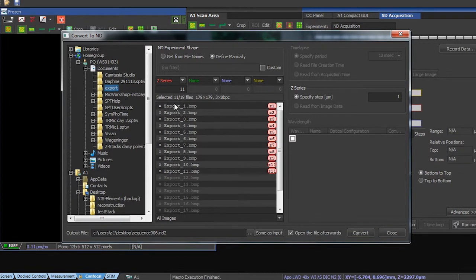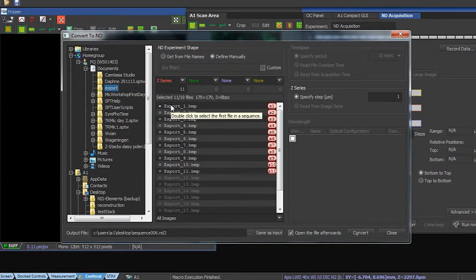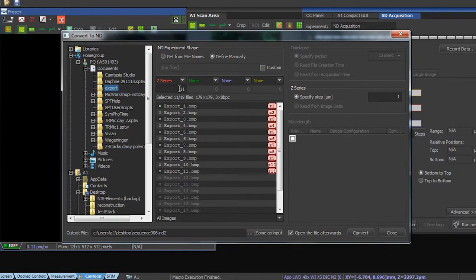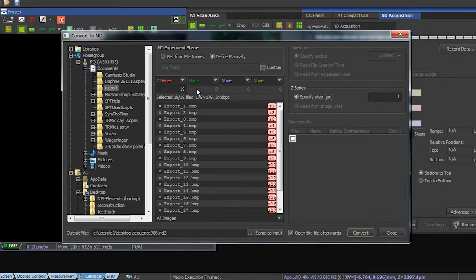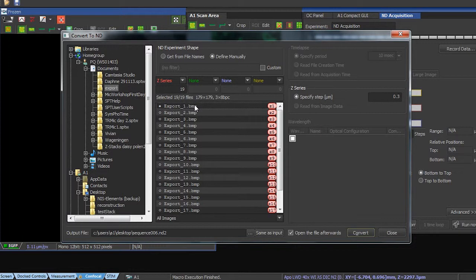So to create the z-stack, the NIS software allowed us to choose the number of layers we want to work with. We have recorded 19, and I want to work with them all, so I click 19. And I can also tell the software what is the spacing between those layers, which in this case was 300 nanometers. And I click convert.